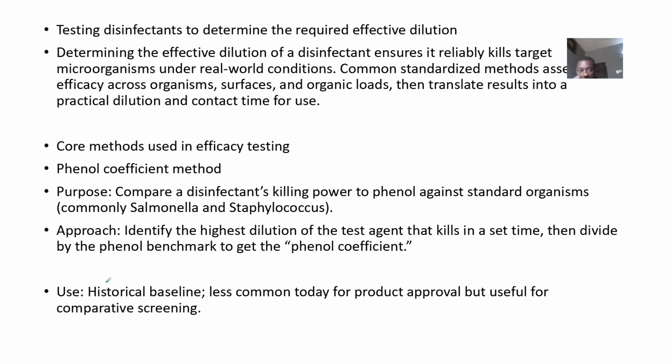So the first test you can do for a disinfectant to know the amount of it that will be effective is what is known as the phenol coefficient method. So in this one, you compare the disinfectant's killing power to phenol. Do you understand? Against standard microorganisms like Salmonella and Staphylococci. So you identify the highest dilution of the test agent that kills in a set time, then divide it by the phenol benchmark, which is known as the phenol coefficient. So you compare what phenol can do with what your disinfectant can do. So it's a historical baseline. It's less commonly used today, you know.